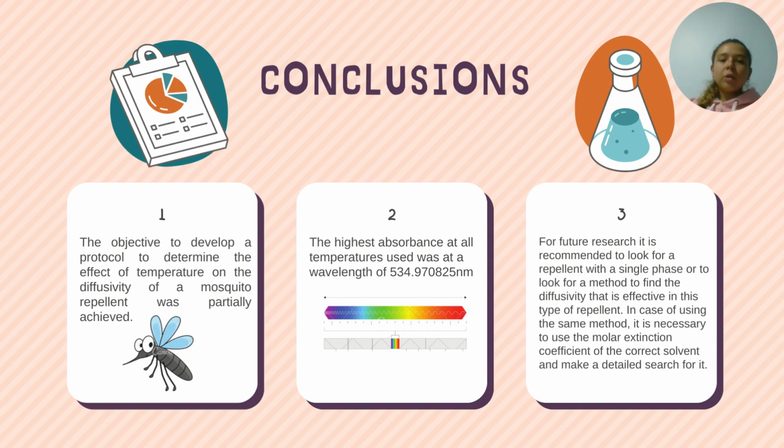Finally, we are going to present our conclusions. The first one is that the objective to develop a protocol to determine the effect of temperature on the diffusivity of a mosquito repellent was partially achieved. This considering that the simplified approximation method did not yield results that demonstrate the correct behavior of thermal diffusivity. That is, the higher the temperature, the higher the diffusivity should be. And this is possibly due to the interactions generated between the oily and aqueous phases present in the repellent.